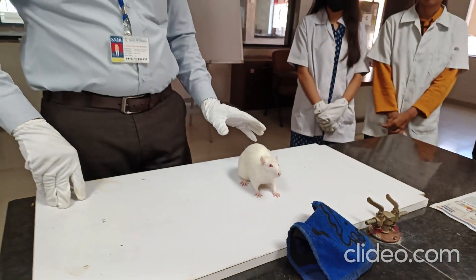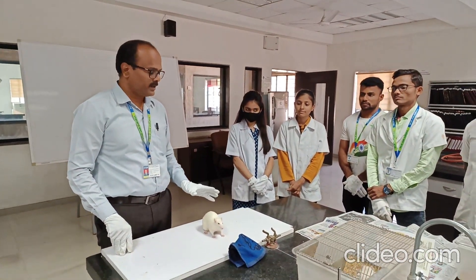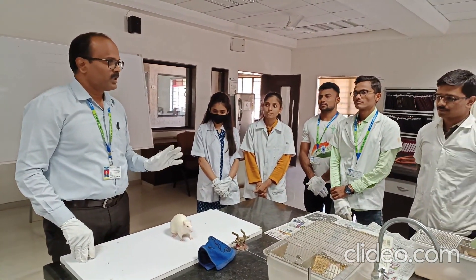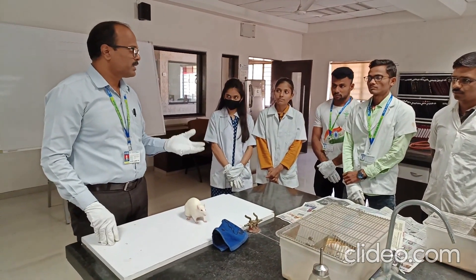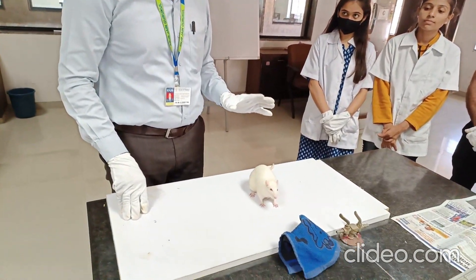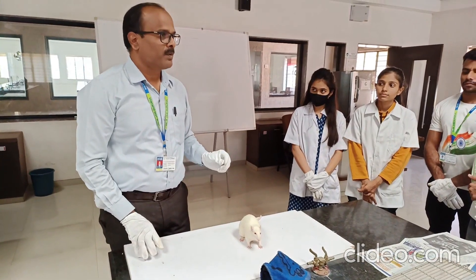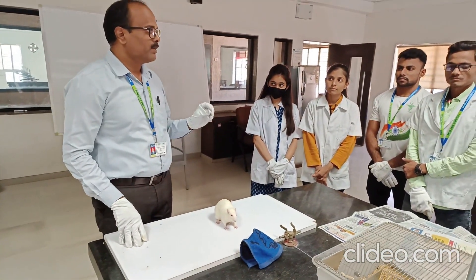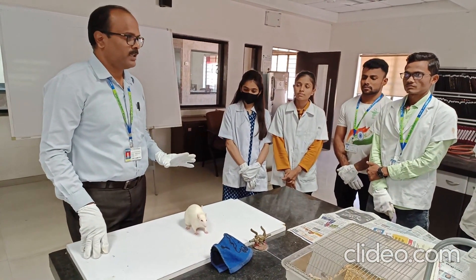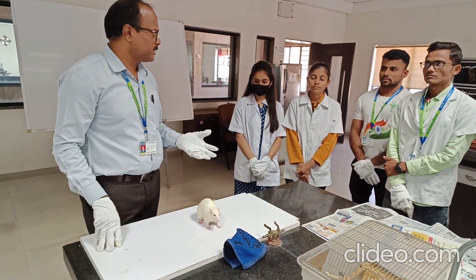Handling of experimental animals is very important when you are doing any screening test. If you handle the animal properly, then only you will get a good response, and at the time of dosing also, proper handling is important. If you handle the animal properly, it will produce minimum stress on the animal and will help you get proper responses.